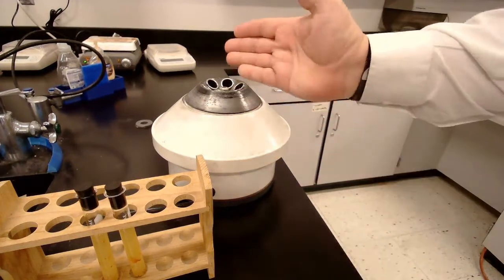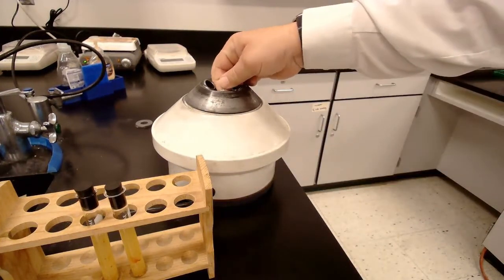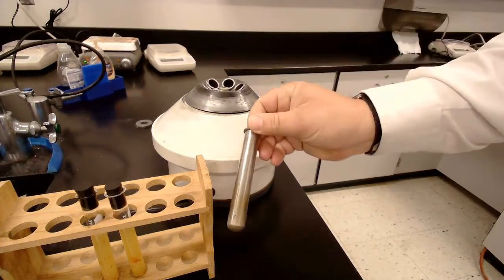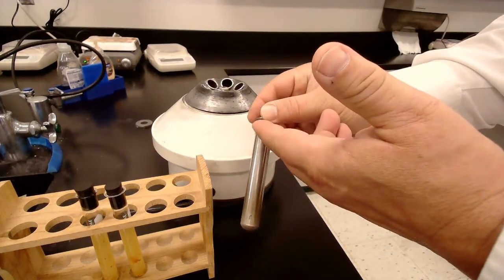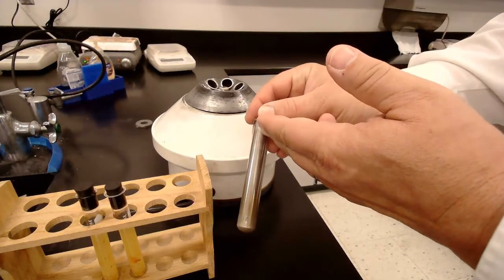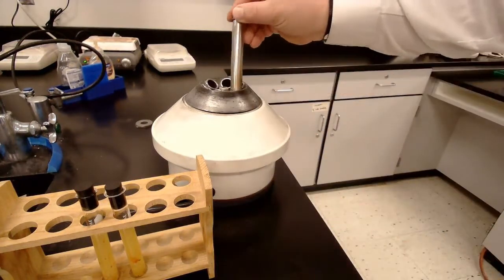The more dense objects will go towards the bottom of the tube, whereas the less dense objects will stay towards the top of the tube, because the heavier it is, the more it's affected by the spinning.